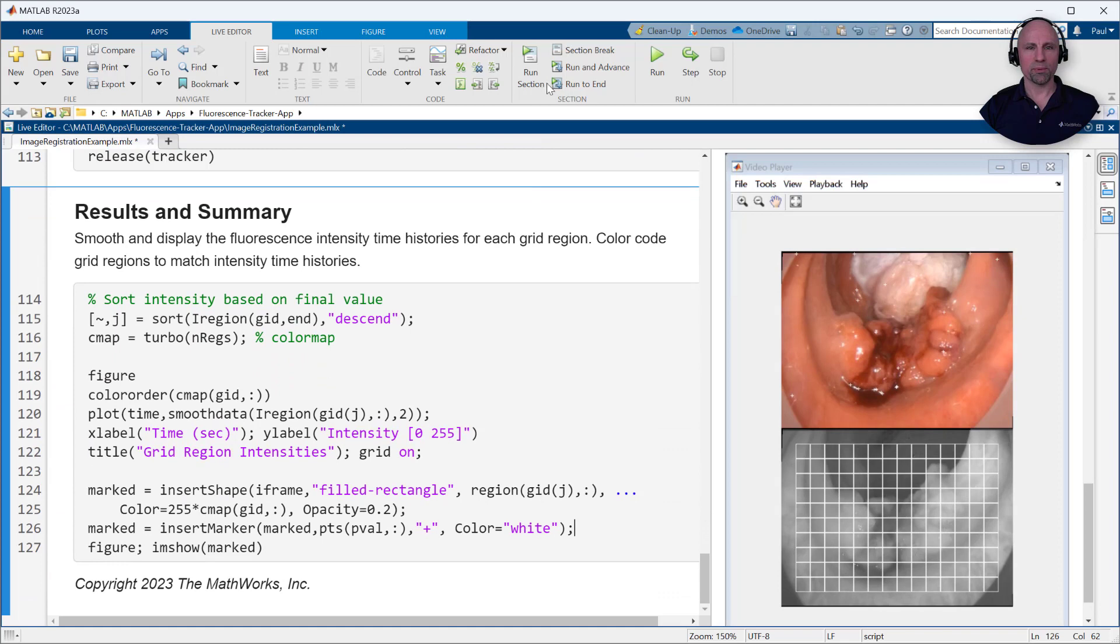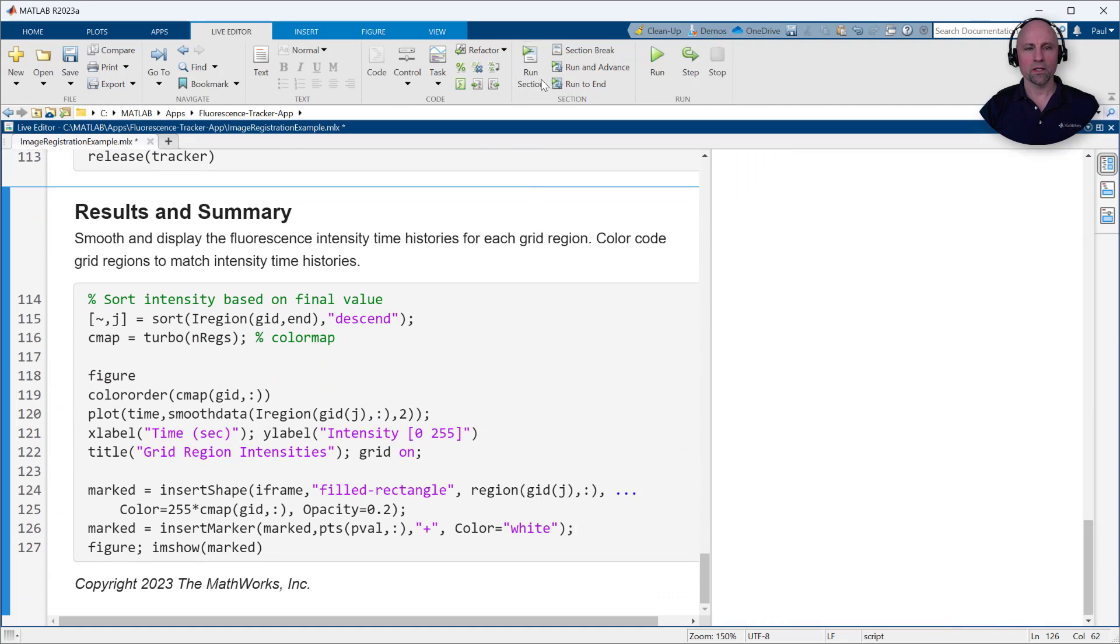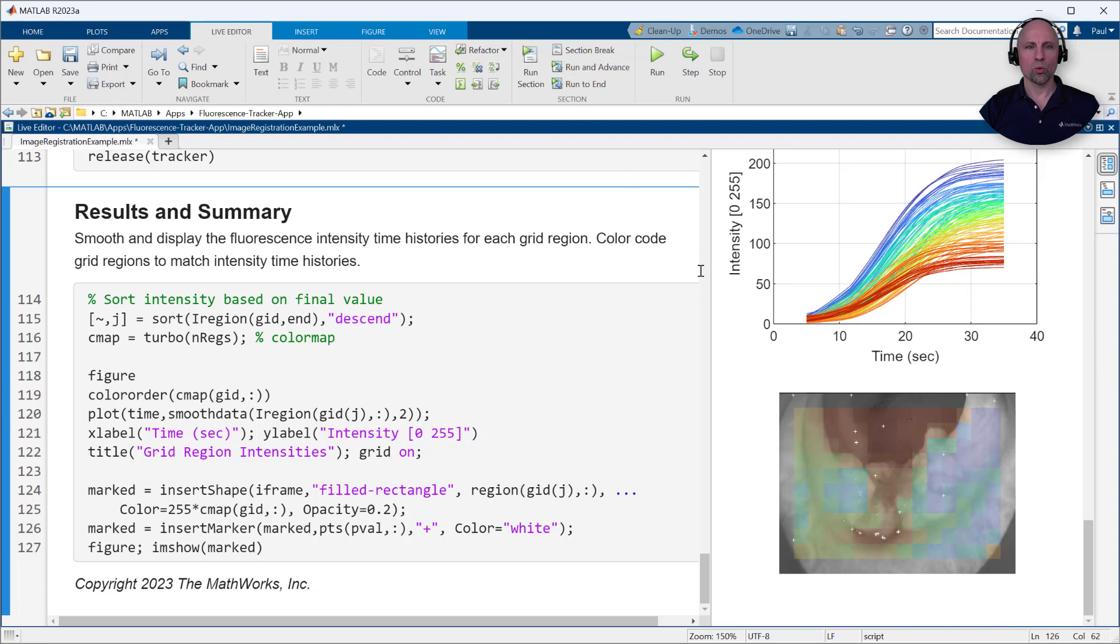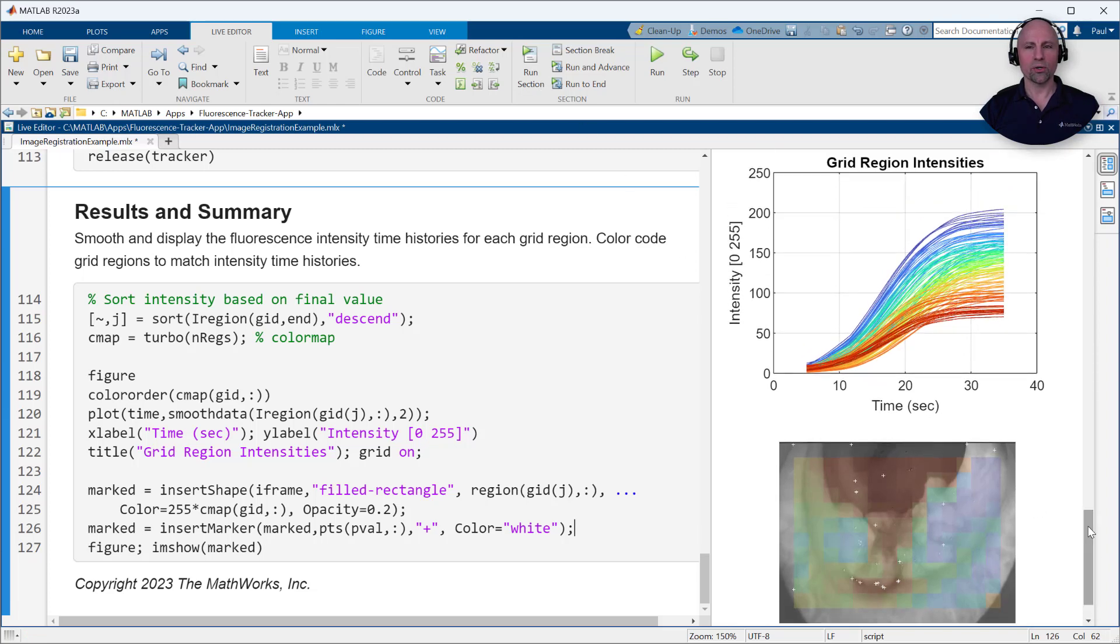Finally, we'll display the resulting fluorescence intensity time histories for each grid region. For visualization purposes, we'll sort the intensities by their final value and color code the grid regions to match the signal colors.